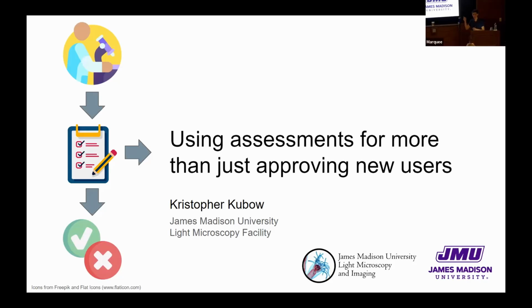I'm also going to be using the word assessment a lot over the next 10 minutes. So just to remind you and clarify, it's just an education term for a tool that lets you measure something about a student. So it could be a survey or an interview, etc. In core facilities, usually the practical competency of the trainee is assessed at the very end by asking the trainee to actually demonstrate that they know how to use the microscope. That usually happens at the very end of the training, and it's what you have to do to get access to the scope. And that's usually where we sort of leave it.